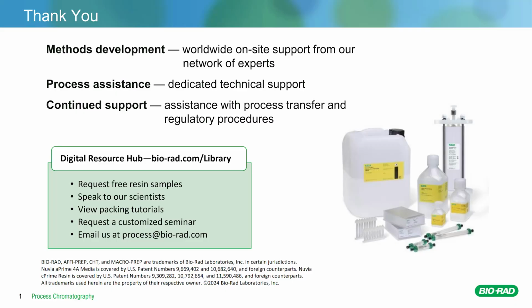Great question. Endotoxin contamination is problematic for all production types. This is because endotoxins can be found on all lab surfaces, in media, glassware, consumables, buffers, and is especially prevalent in our lab water sources. Therefore, it's really important to test for endotoxin levels often. In in vitro cell culture studies, their presence has been shown to affect cell lines as well as cell line growth. And this is especially true for cell lines involved in the innate immune system, such as monocytes and macrophages.